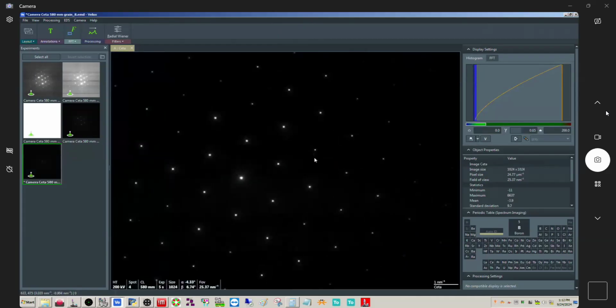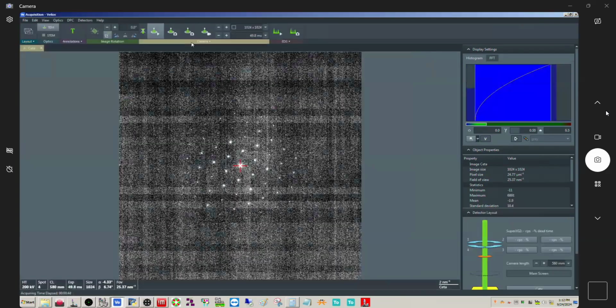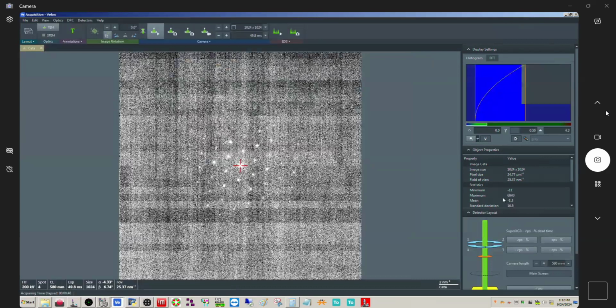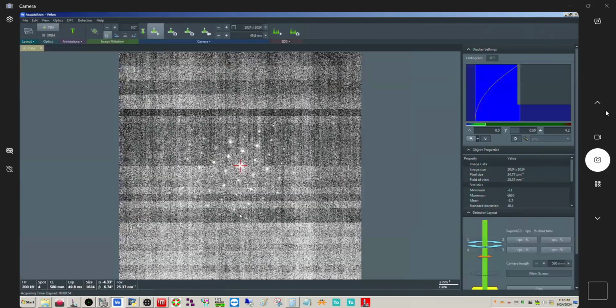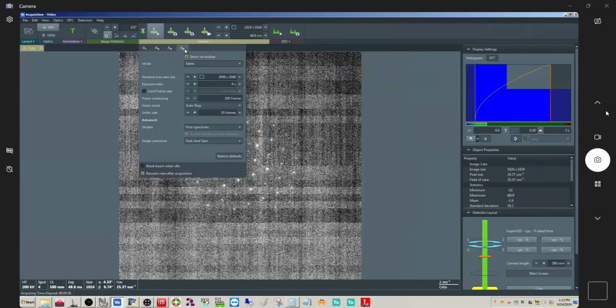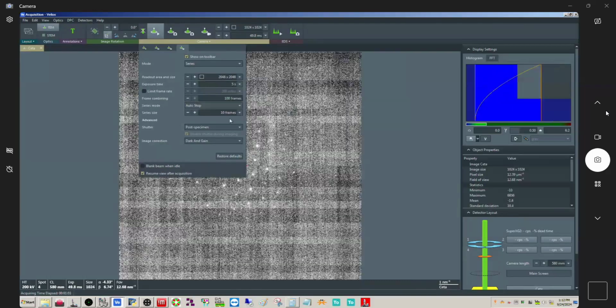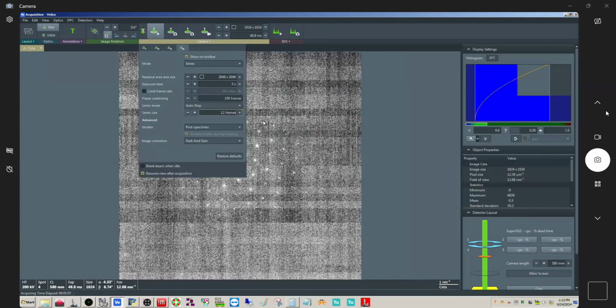The other thing that we can do, I should say, is series acquisition. So we can do a series of these. We're doing 5 seconds. Let me go back. Yes, so my max is safe, I'm under the 8,000 count limit. So go to series here. And we want to do 5 seconds, 100 frames, and we'll do 10 frames. Well, let's make it 12, so we round it out to an even minute. 12 for the series.